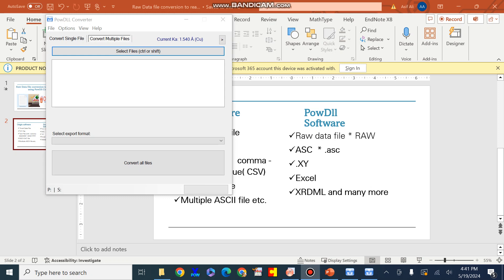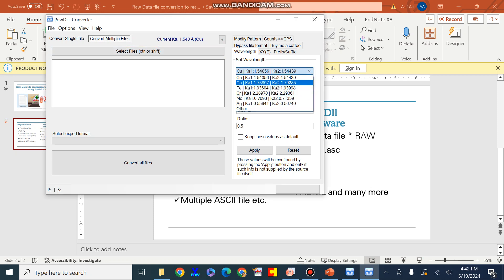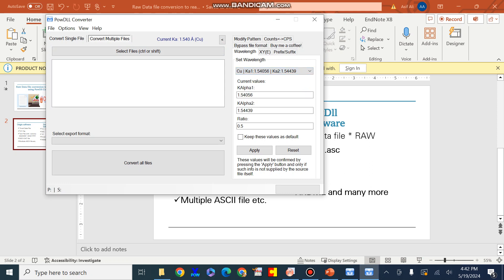From here we can see that with the help of this PowDLL software we can convert a single file or multiple files at once. The copper K-alpha radiation source used for XRD raw data has a wavelength of 1.54 Å, but you can change this wavelength as per the machine, since raw data obtained from different machines may use different copper K-alpha radiation wavelengths or sources.